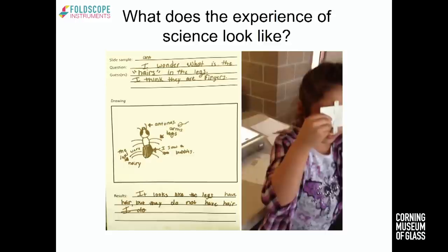What I like about this video is, one, that it's adorable, and it's a great video to show people the excitement that you can have from looking under a microscope. But there's more going on here. She's making this observation, she's excited about it, but she's also synthesizing information. You can see even in that first glimpse, she's identifying, oh, I can see its face.